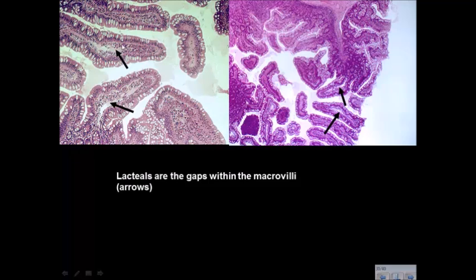These are the lacteals right here within the lamina propria, okay, of your digestive tract. The lamina propria is a connective tissue in these folds called macrovilli. And the microvilli, as you recall, is the brush border of your simple columnar epithelium, and all these cleared out areas are goblet cells making mucus. So the lacteals is where you absorb fat. So these are lymphatics, low power and high power of the same tissue.